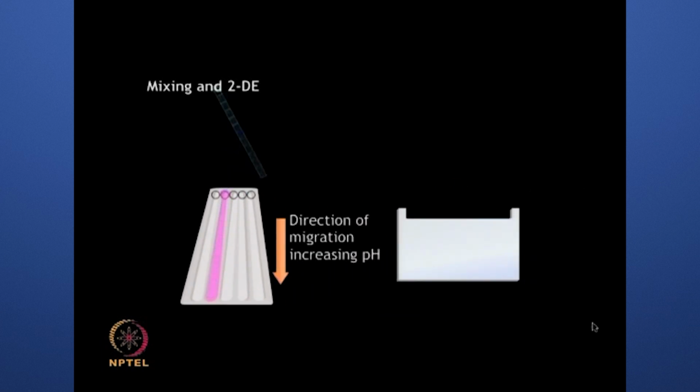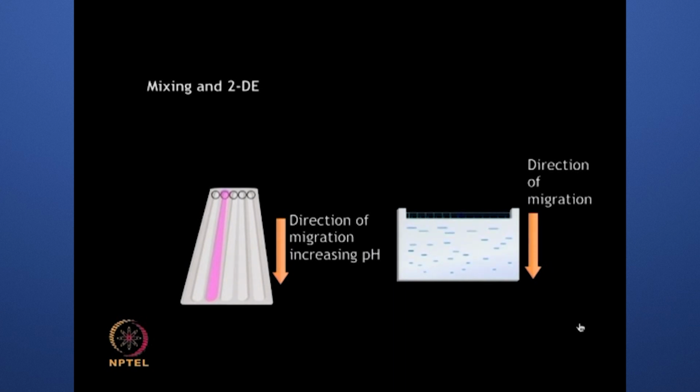The separation takes place on the basis of isoelectric focusing in the first dimension, followed by the molecular weight separation in the second dimension.